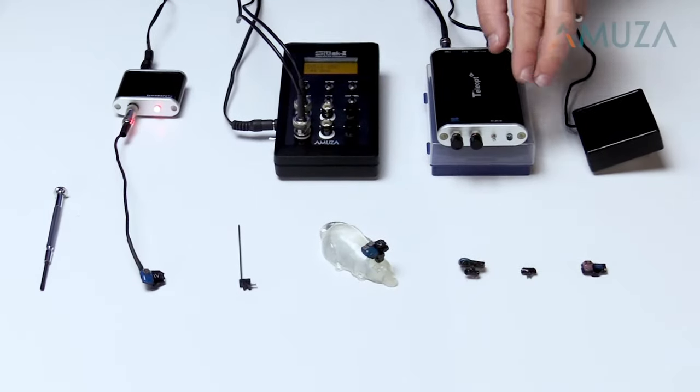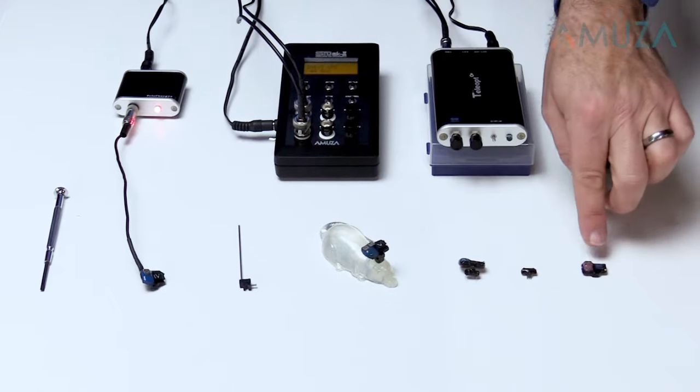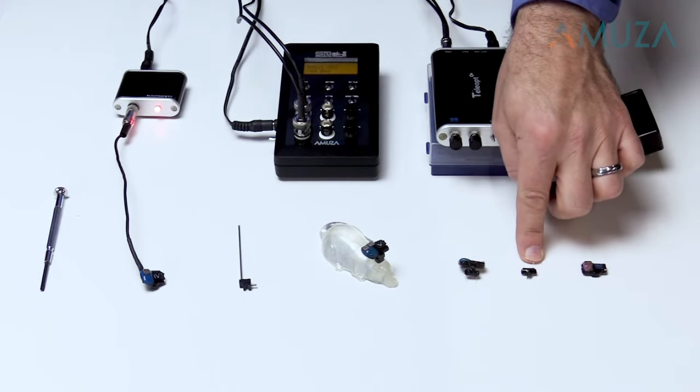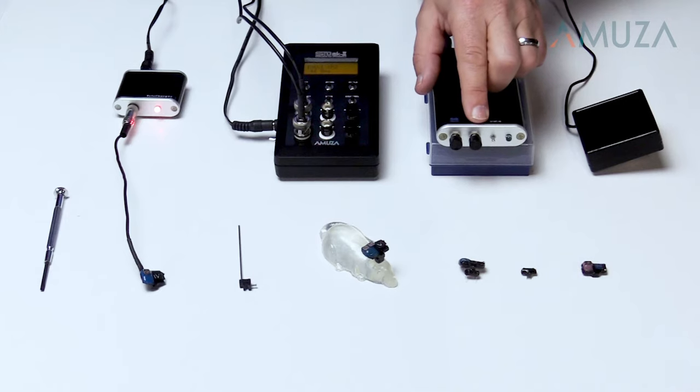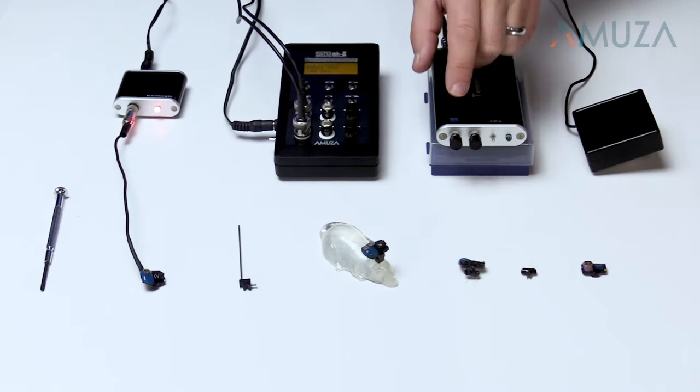The Teleopto system consists of a remote control, wireless receivers, and LED fiber optics. The whole system is ready to use out of the box. Just plug it in and you're ready to go.